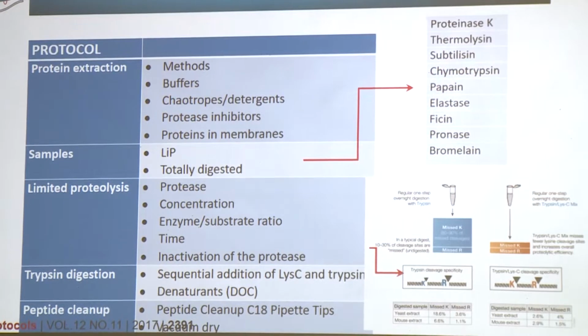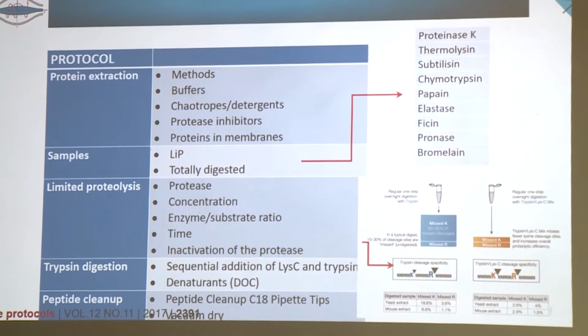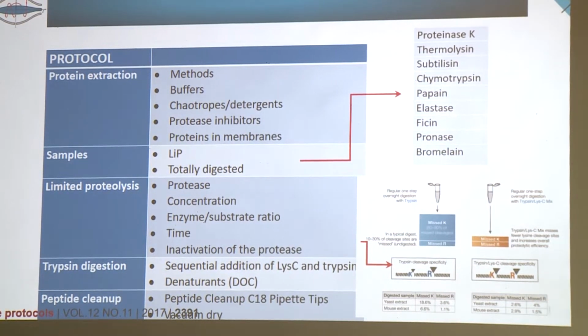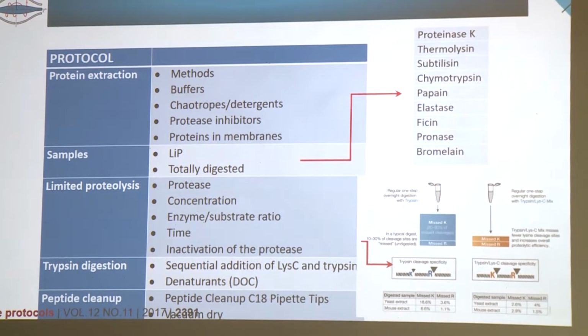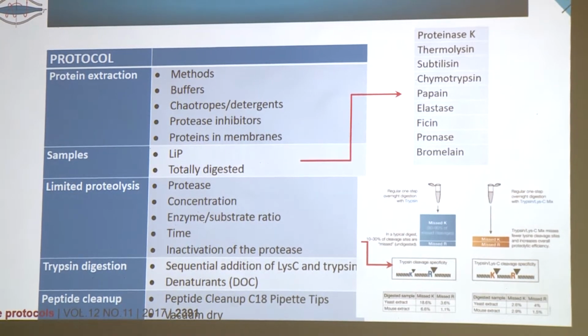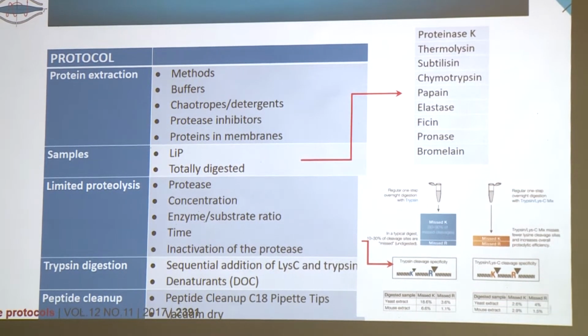So let me go quickly through some of the technical aspects of the methodology, because in some of the technical aspects you can then discover the problems and the advantage of the methodology. Well, always you have the problem of a protein extraction. Until now, this is a methodology that is working mainly with extract. So you have to take your tissue or your cells, make the lysis, and then from the extract you have to check and analyze the effect.